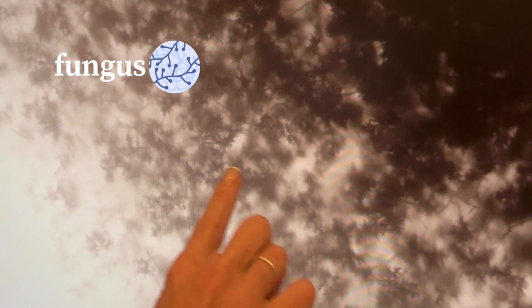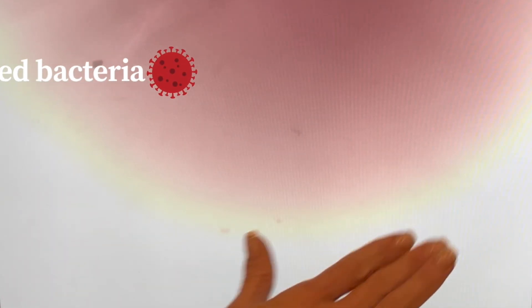This is really interesting — what we're seeing here has been grown on one of the petri dishes. This is a fungal component that's grown, and I can tell that because we're seeing all of these little branches on here. So this is definitely very interesting to see zoomed in — one of the kind of green components that is on the agar petri dish. This is also very interesting — we have a very circular bacteria that's red that we saw on one of the phones. This particular agar sample, when I took off the cover slip, I actually noticed it smells a little bit from the bacteria that's growing.